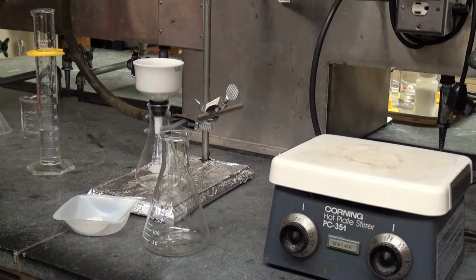Macroscale recrystallization. Recrystallization is one method to purify a solid compound. You need a solvent that dissolves the compound well at a high temperature and poorly at a low temperature. Combinations of solvents are also used to recrystallize compounds. In this experiment, you will be purifying benzoic acid using water as a solvent in a macroscale experiment.